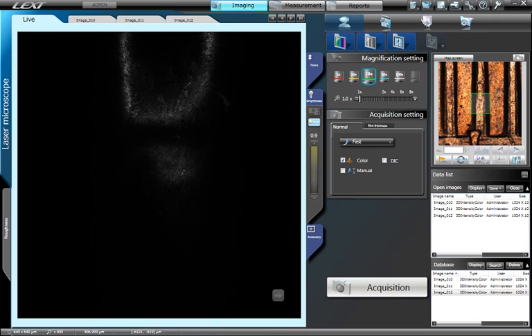There are a few different options in the Acquisition Settings window. Check Color if you wish to acquire a color image to be overlaid on top of the laser confocal image. Check the DIC box if using Differential Interference Contrast. Leaving the Manual box unchecked will have the LEXT automatically determine the top and bottom limits of the confocal image acquisition.